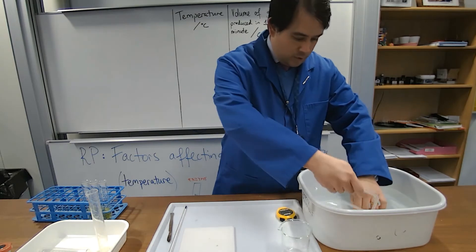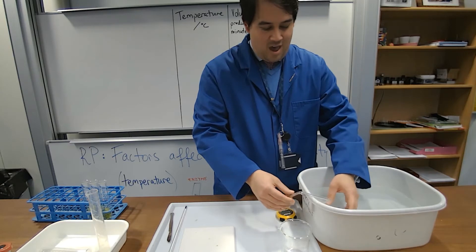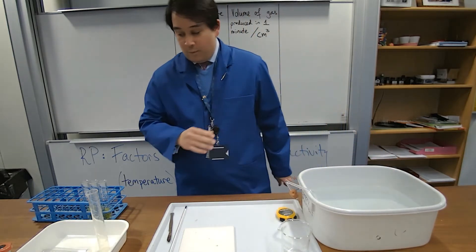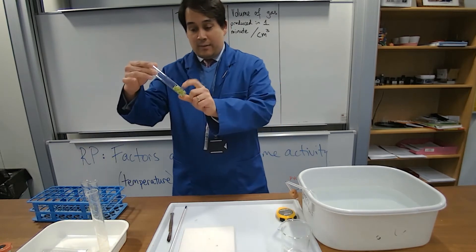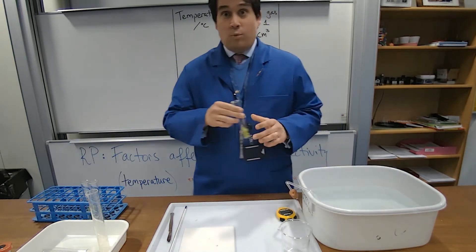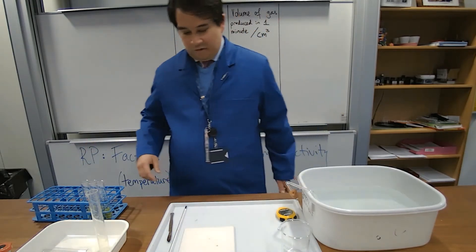And then we're going to use this U-tube. I'm going to rest that there for now. It's totally filled with water. As gas is made from there, it will travel along the tube and force out any water that's in there. Quite a simple, elegant experiment, actually.